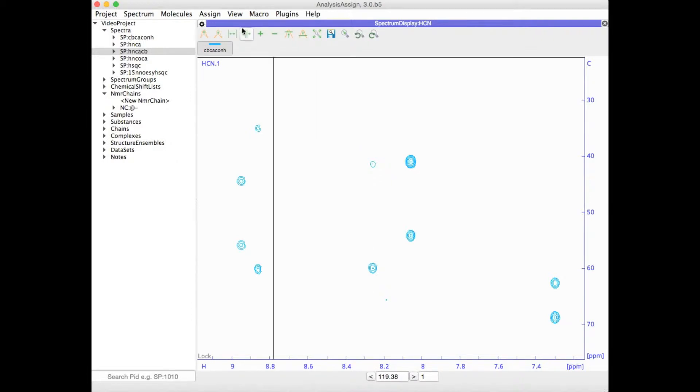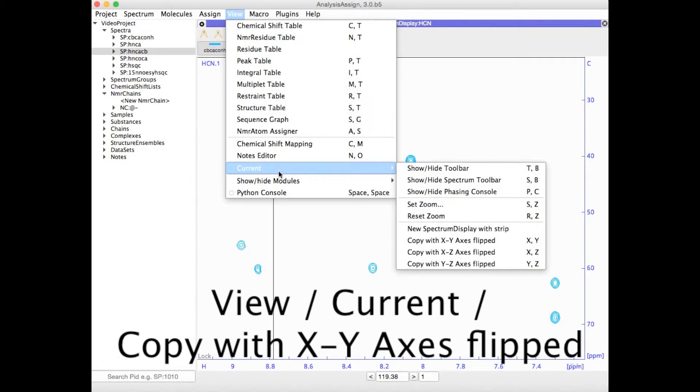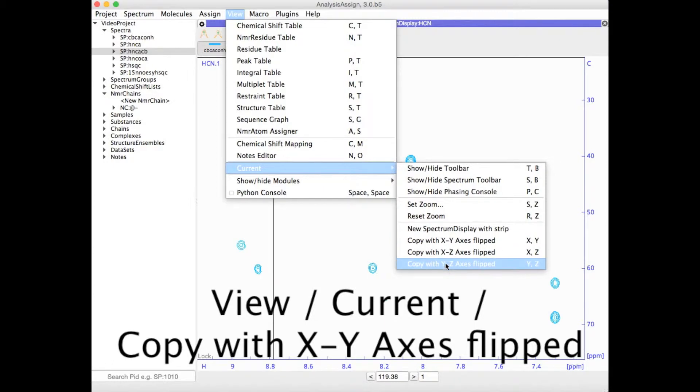You can also go to View, then Current, which will act on the currently selected display with the highlighted axes, and then go to Copy with XY axes flipped, XZ, or YZ.